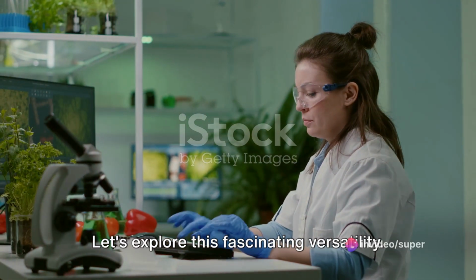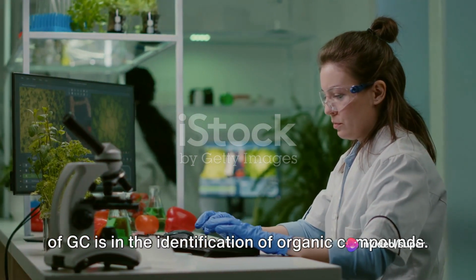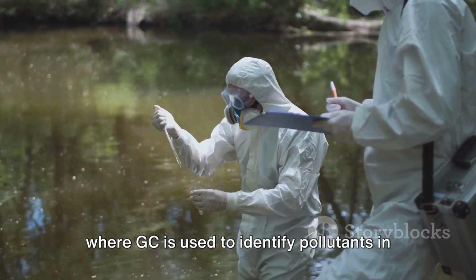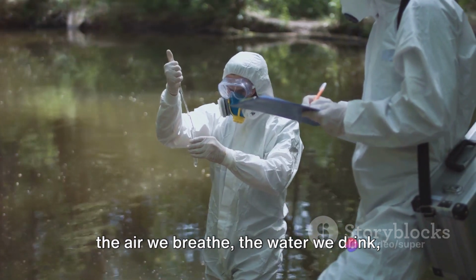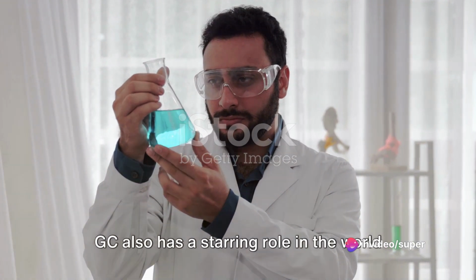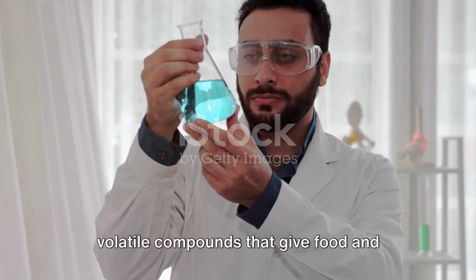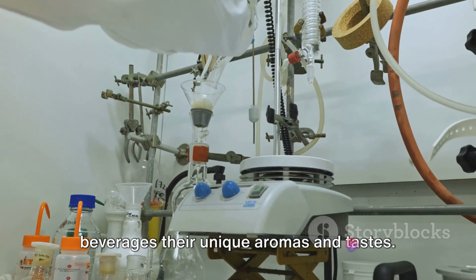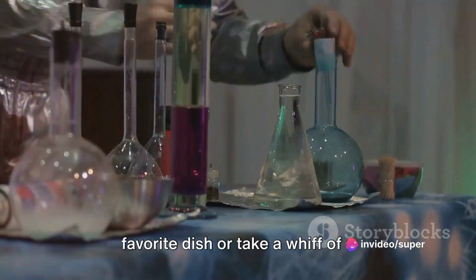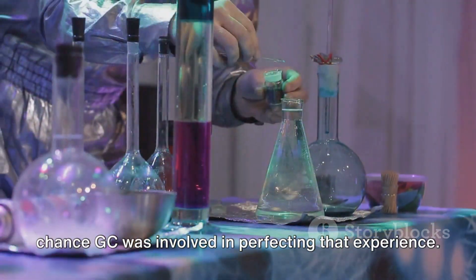Let's explore this fascinating versatility. One of the most widespread applications of GC is in the identification of organic compounds. This is crucial in environmental analysis, where GC is used to identify pollutants in the air we breathe, the water we drink, and even the soil that nurtures our crops. GC also has a starring role in the world of flavors and fragrances. It helps us detect and quantify the volatile compounds that give food and beverages their unique aromas and tastes. So, the next time you take a bite of your favorite dish or take a whiff of a fragrant flower, remember, there's a good chance GC was involved in perfecting that experience.